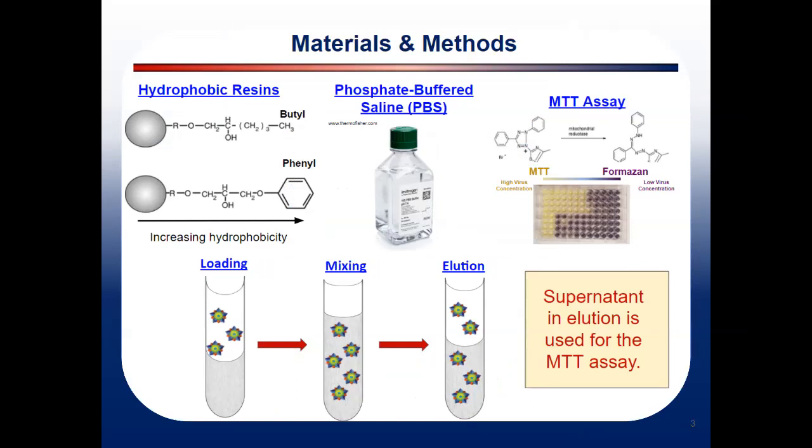In this experiment, the virus is diluted with phosphate-buffered saline solution at different salt concentrations. This is to test the effect of salt concentration on the adsorption of PPV to the resins. The expected effect is that it leads to an increase in binding between the resins and the virus.